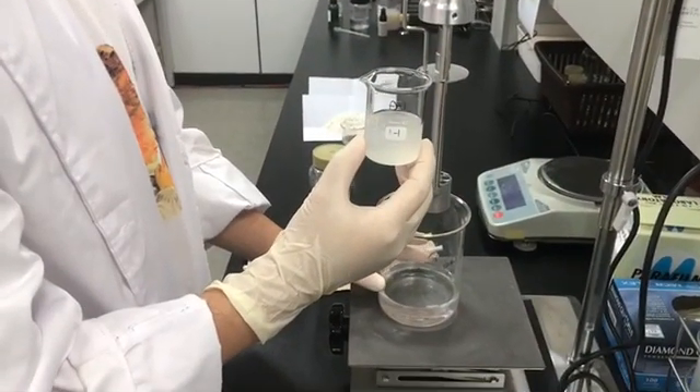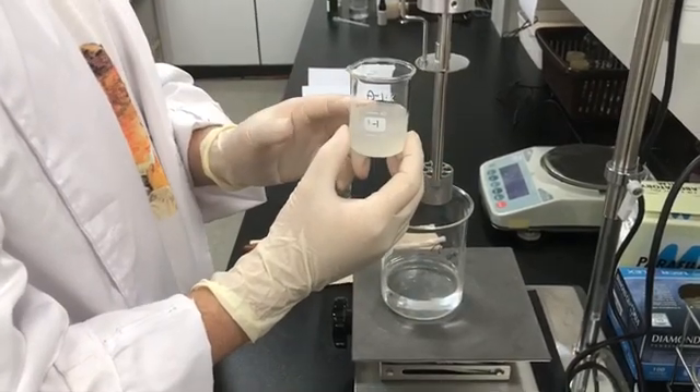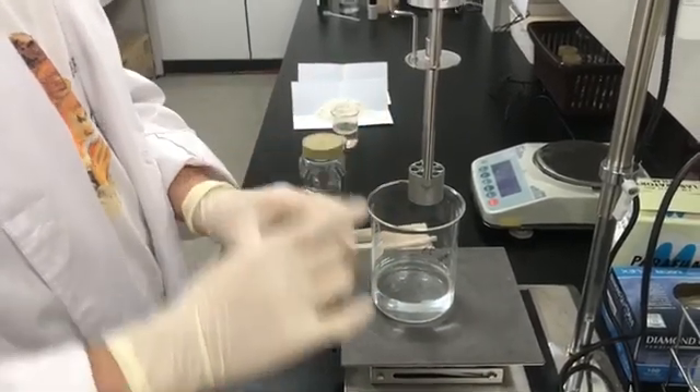First, adding A-1 into A at around 2,000 rpm for 2 minutes.